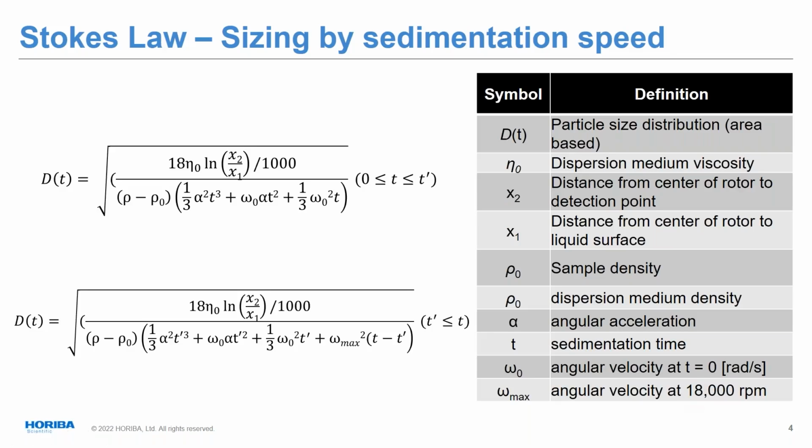And so, again, as you can imagine, this is a totally automated system run by a PC. All these equations are built in. You put in the parameters for your particular situation, the particles you're interested in, and everything else is done for you automatically. We'll show you how you set it up here in a moment and give you a little better understanding. But this is the direction of the rest of the seminar. This is mostly what we measure nowadays. You can measure lots of different things here because you have variable centrifuge speeds you can select, but in most cases we're looking at much smaller things where we're going to worry about using the centrifuge up to, as you can see at the bottom right there, 18,000 RPM.